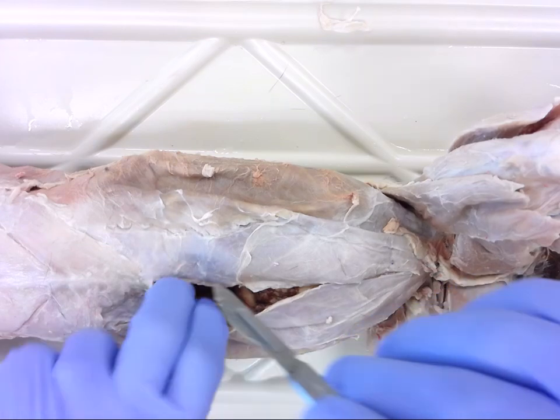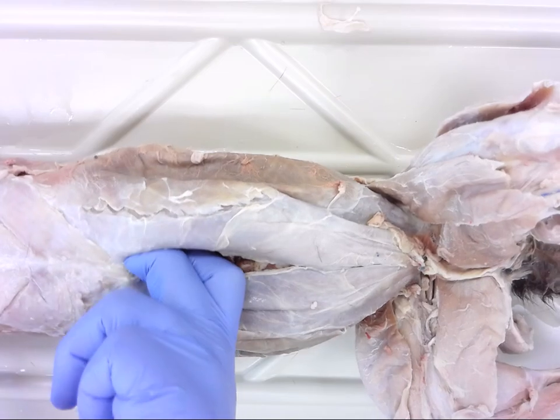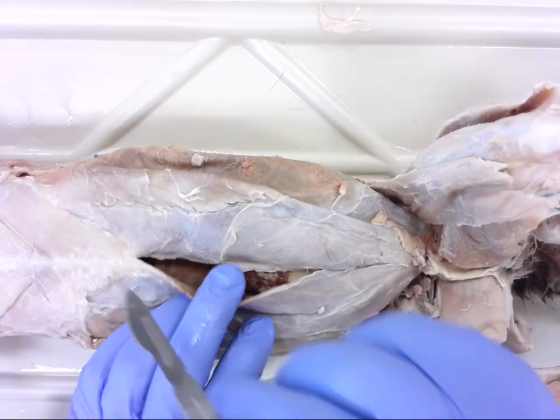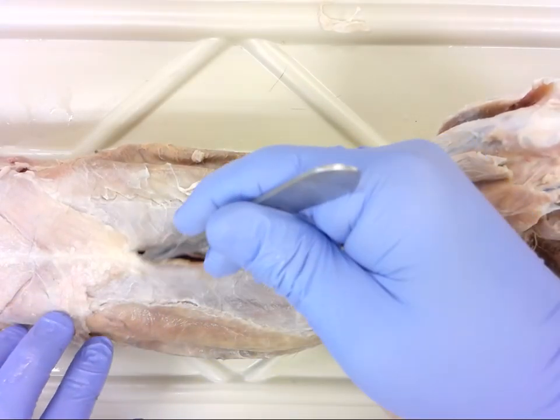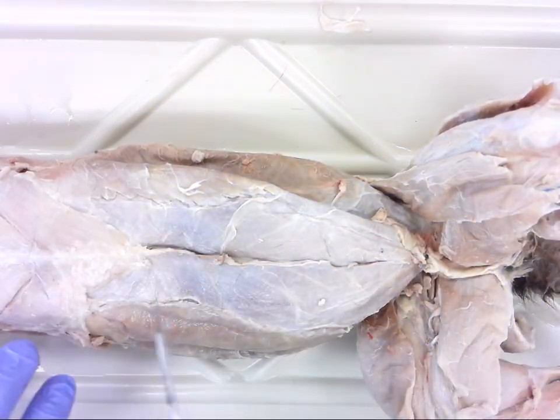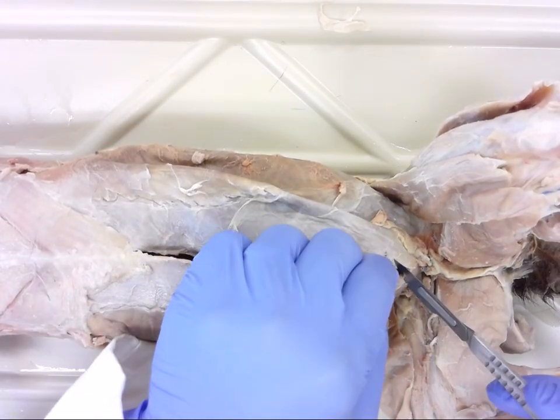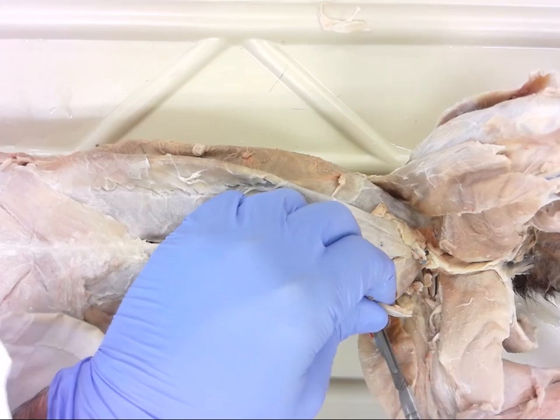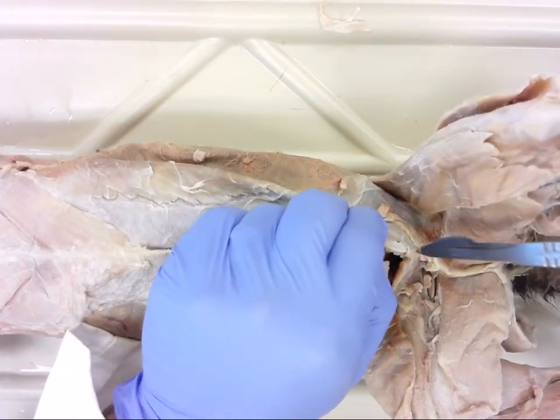Now, when we get up to the top, you may have to sort of stick a finger in to see where the diaphragm is, because we don't want to lose a lot of this pectoral musculature. So once we make that incision, we'll come down to the bottom, and I'll make another one that comes right along the side, fairly low, and I'll do the same thing on this side as well.